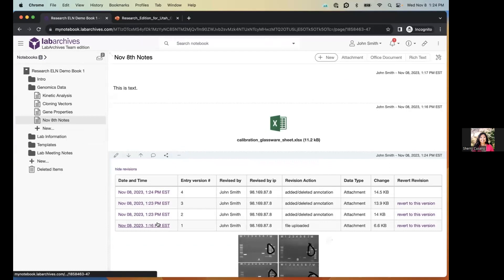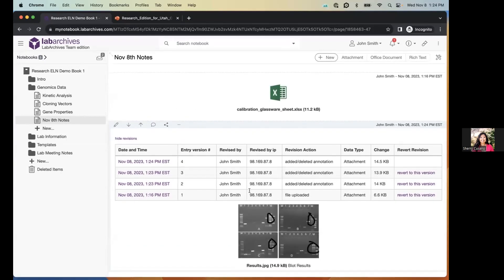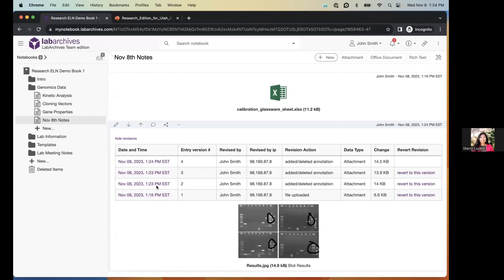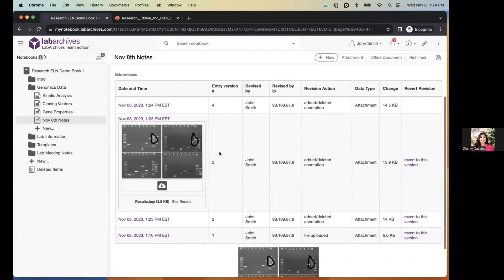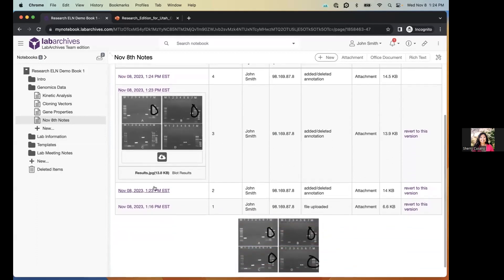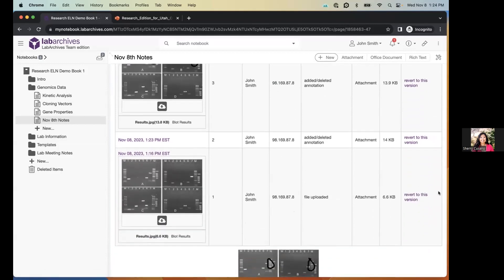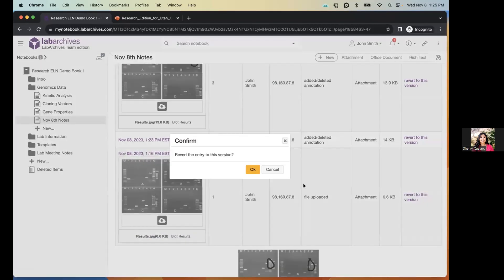After closing that tab, the annotations are reflected in your notebook. If you hover over the entry, click the triple dots, and select 'View Revisions,' you can see everything done to this entry. The revision history shows a date and time stamp of exactly when each revision was made and who made it. You can click on any timestamp to see what the entry looked like at that time, and even revert back to earlier versions.